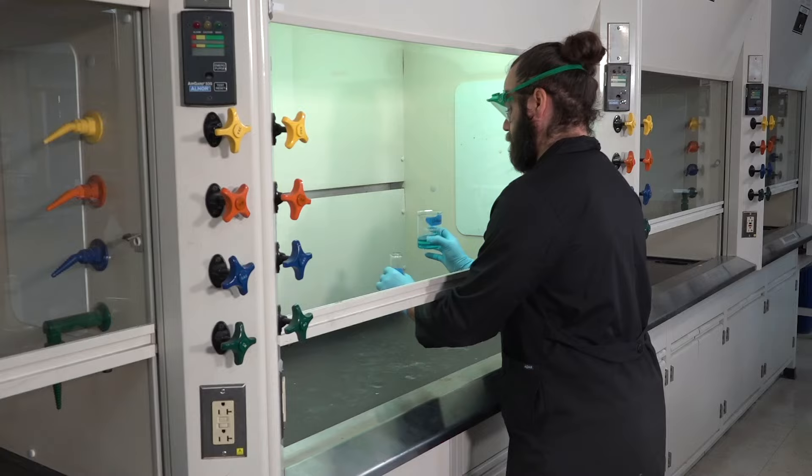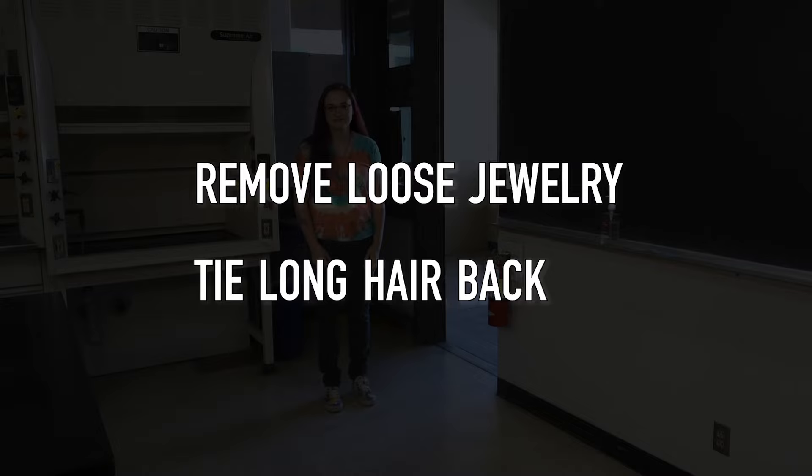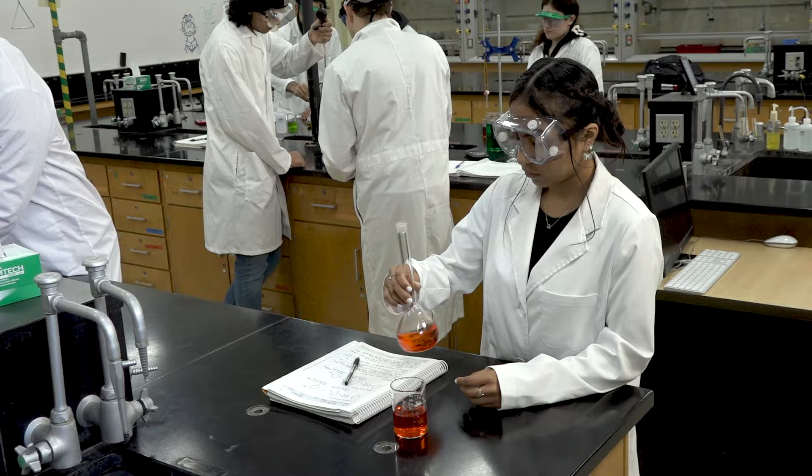Before you start handling chemicals or heat sources, it's important to remove any loose jewelry and tie long hair back. Long hair is prone to fall into chemicals or catch fire, while loose jewelry can catch on glassware and lead to spills.